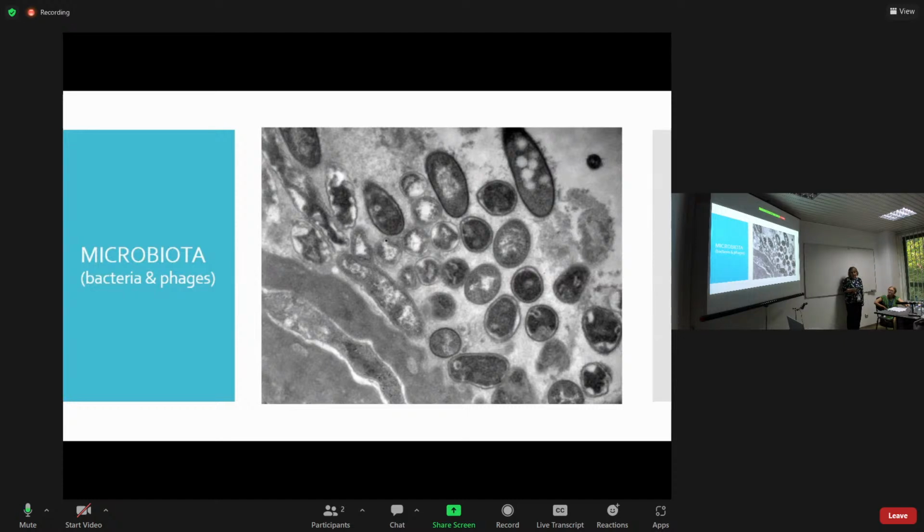So this is the story I want to tell you about the electron microscopy as a useful tool for diagnosis of unknown infectious agents, mainly viruses, but also I believe will be a good tool for the study of bacteria and their viruses, fungi, because the microbiota is a new topic in medical field, and we know very few things about this type of cell in our body.